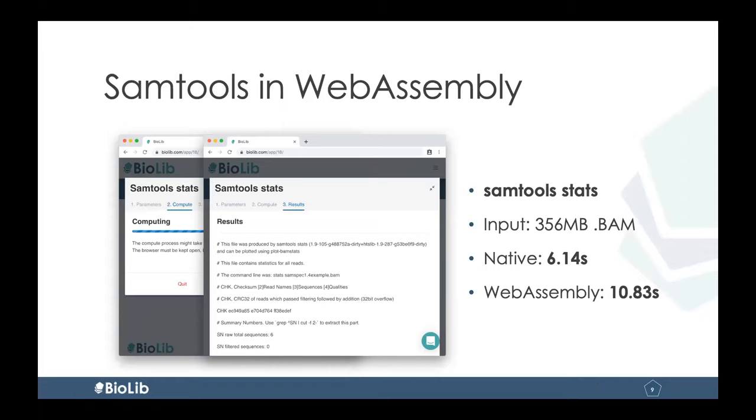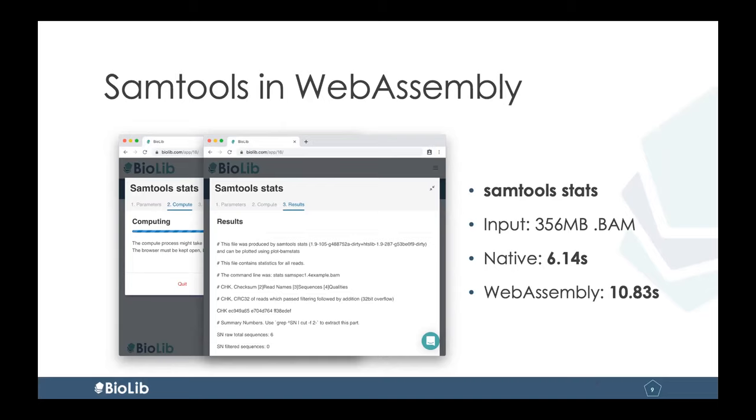And because the compute happens on the client side, whoever is hosting the model don't actually have any expense for regards to compute cost. And also, therefore, do not expose any limitations. Quite typically in a web server, you will see that you can maximum submit 10 sequences at a time or something like that. You don't have this problem when you're running things on the client side. And specifically for Samtools here, so to test that out, I tried a relatively large file. So almost half a gigabyte BAM file, and I ran the command Samtools stats. When I ran it on my MacBook locally, it took six seconds, and it took around 10 seconds when I ran it in WebAssembly. So a bit of a performance penalty, but really not a lot. Given that it's so much easier to use now since it's in a browser, it's probably actually worth it.